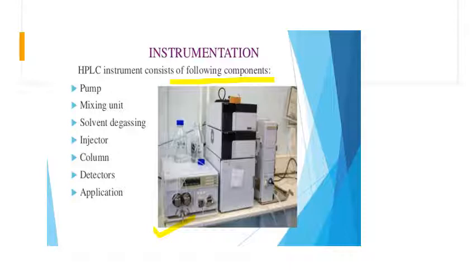In the picture, you can see two containers. This is called the solvent reservoir system, in which the solvent or liquid phase, which acts as the mobile phase in the technique, is stored. That's why it is called the solvent reservoir system.